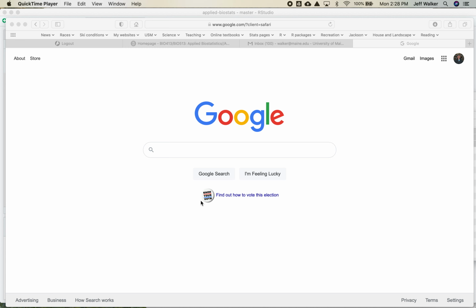Okay, let's learn how to find the components for this project. Install them on your machine. So I'm going to install the software Fiji and a plugin for the software Fiji onto my Mac. And so everything is going to be for the Mac operating system, or the Mac OS.